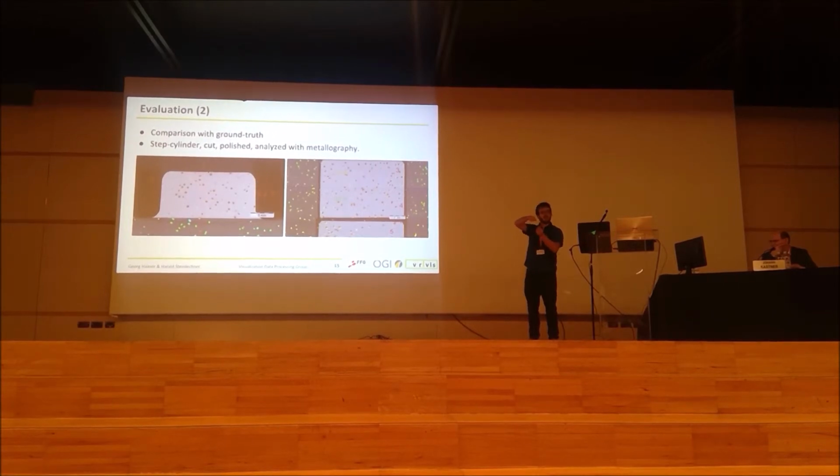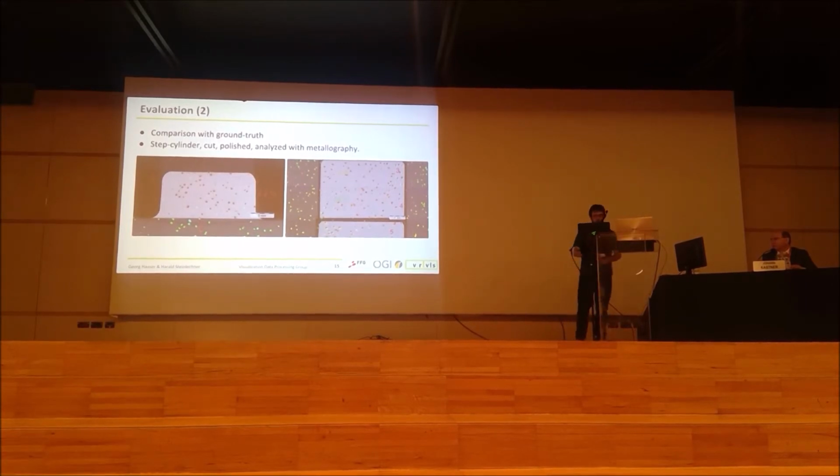Next, we aligned it with a slice. We marked it with a cut in order to find the slice, and then we compared the detected pores, and we were quite happy that they match up pretty well.